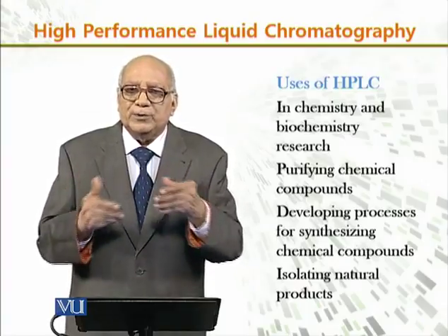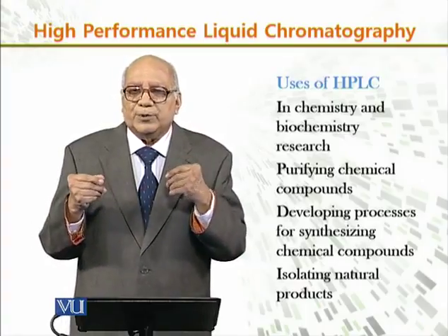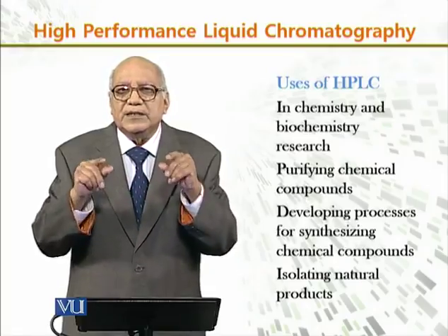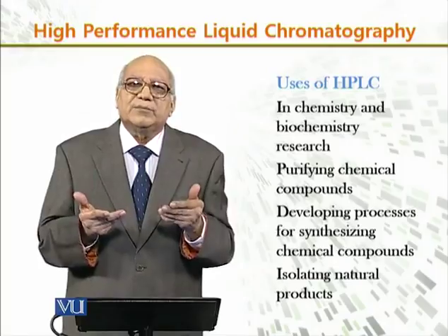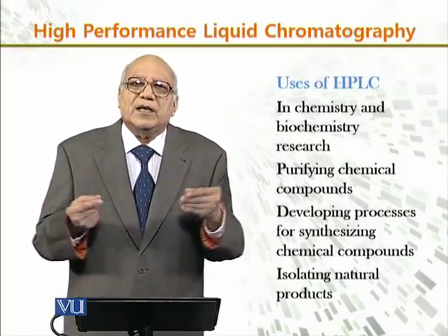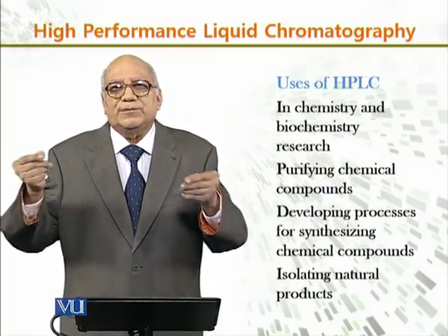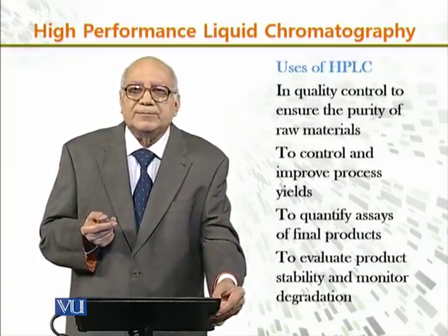It is used for purifying chemical compounds, for developing processes for synthesizing a chemical compound if you have to develop a process. And then, of course, because this is a chromatographic technique, you can use it for isolating natural products, for isolating the different metabolic products which are there.